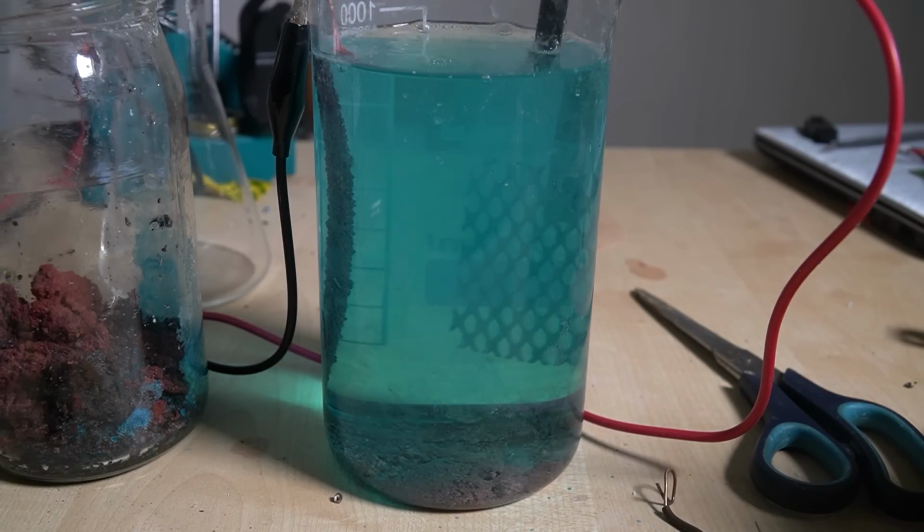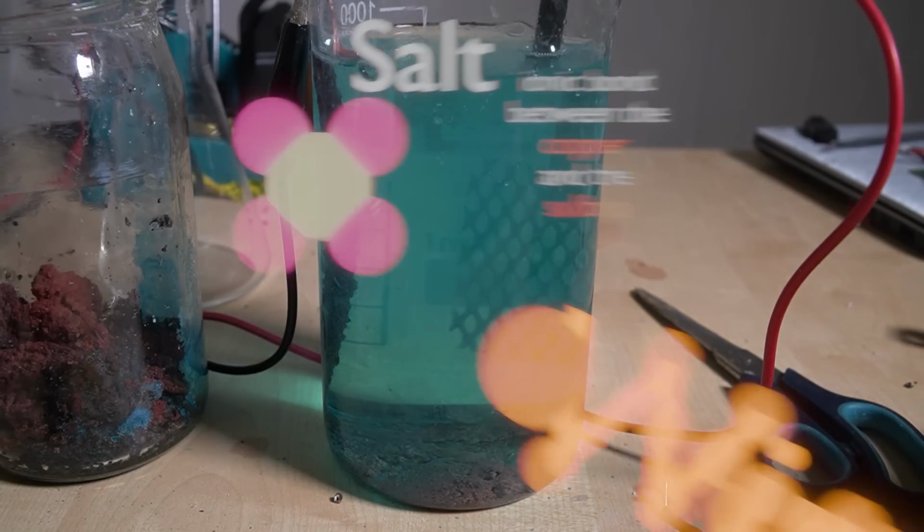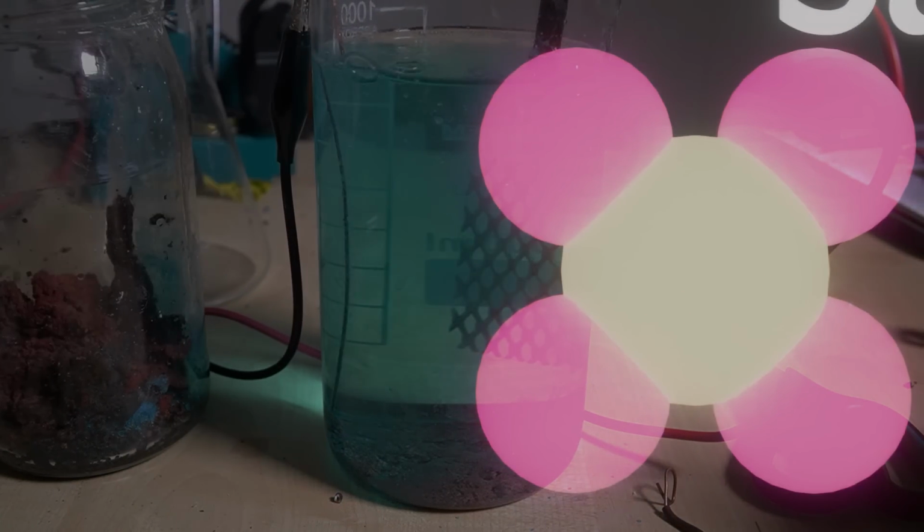Oh, that's a good time-lapse. I mean, oh, the color change? Anyway, we chuck in some electrons at copper, it's no longer positive, and so it just accumulates on the wire. Great. Now, as it just so happens, on the other side, we're electrolyzing water and getting some extra hydrogens.